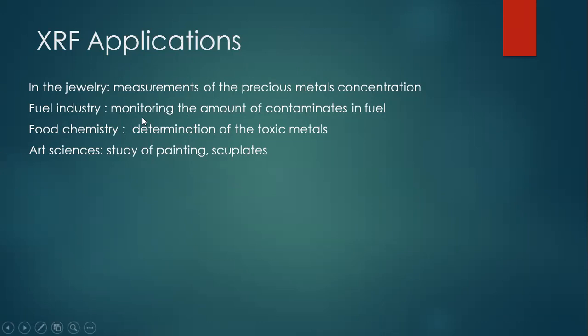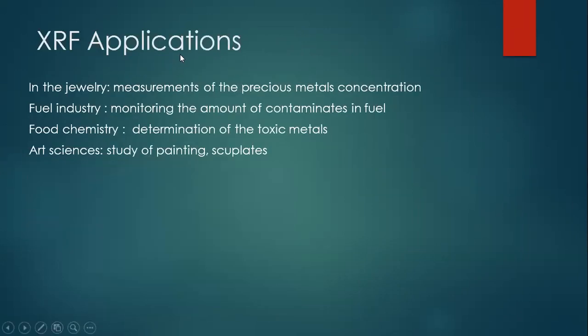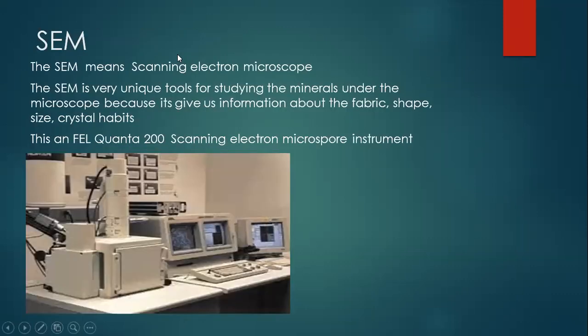In the fuel industry, it is monitoring the amount of contaminants in the fuel. So XRF is also a very important application for geologists or those working in the petroleum industry. So this is the main function or application of the XRF.